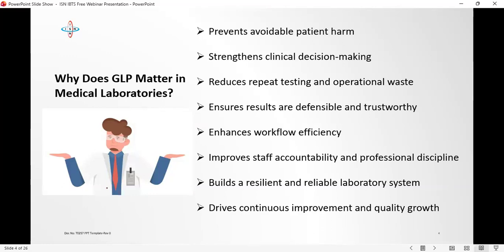However, when the result got to the clinician, the doctor looked at the result and said, this does not match the patient's clinical picture. Just imagine that statement alone is something that every laboratory professional should take seriously. You confidently send out the result, and your clinician is telling you that the result you just sent out does not match the patient's state.